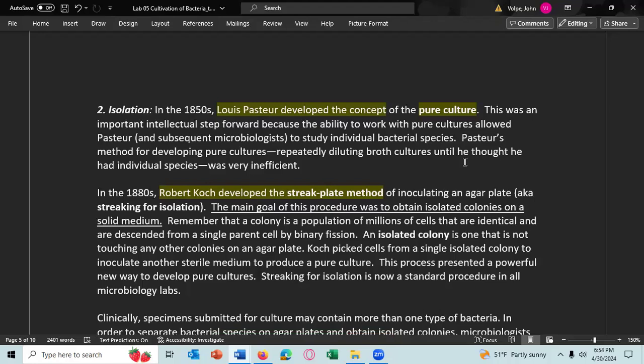What you do is you streak out the bacteria on a plate, get isolated colonies, select one isolated colony, grab the cells from that one isolated colony, and then streak it out again on another plate of media, getting isolated colonies. Once you've got cells that have gone through 2 colony formation events, you have a very high chance that you have a pure culture. It's greater than 95% chance that you'll have a pure culture. And that is good enough for microbiology.